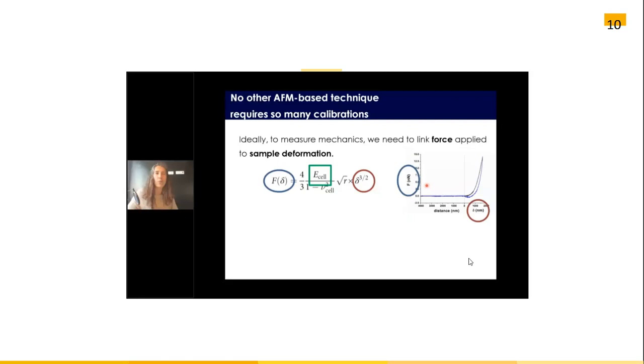To measure the mechanics, the force applied needs to be linked to the sample deformation. It should be noted that AFM does not directly measure the force nor the indentation of the sample. It should not be confused with the deformation of the cantilever.